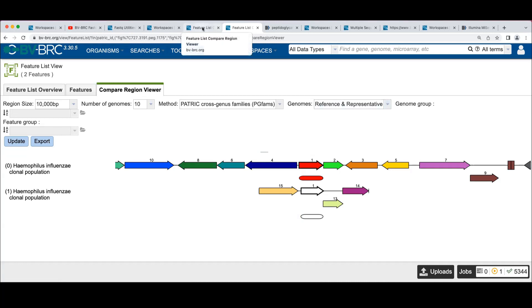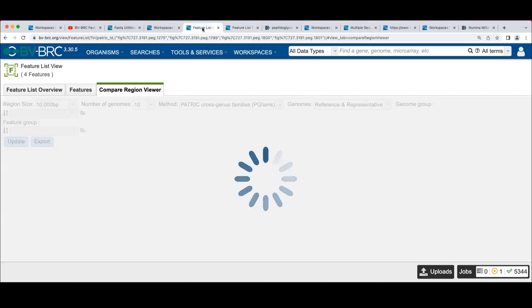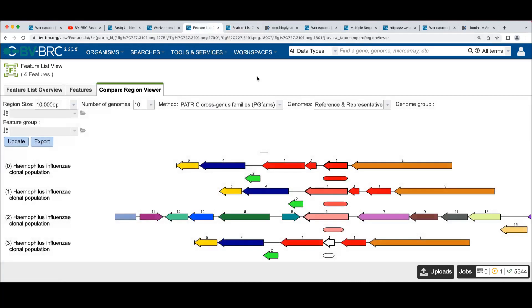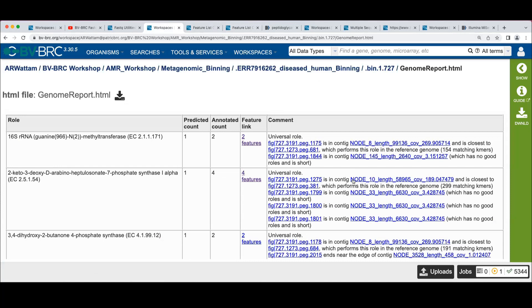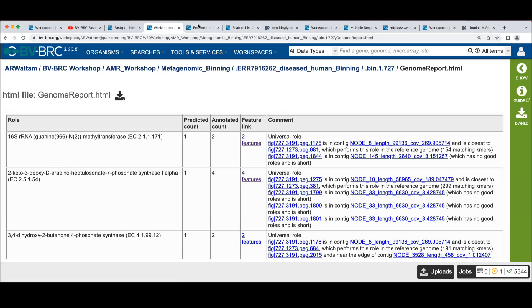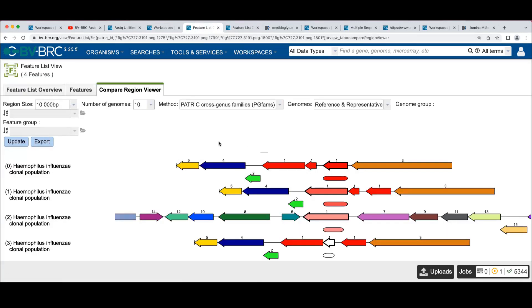Let's see if this other one. I clicked on the next now. Oh, here we go. So this one, I clicked on this next one down here that was predicted to have one and we had four of them.